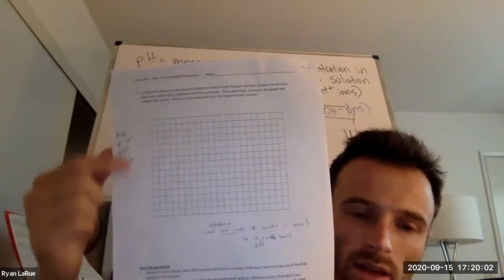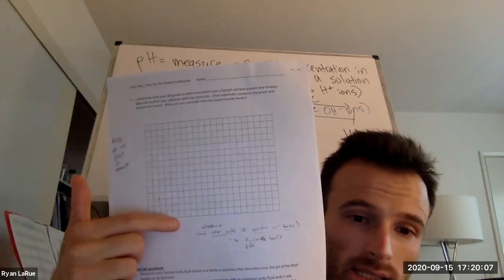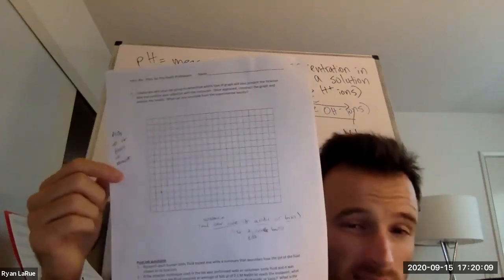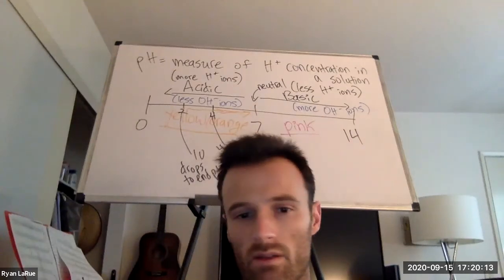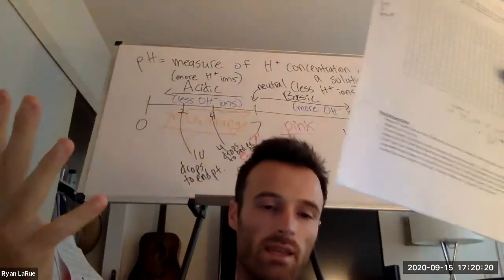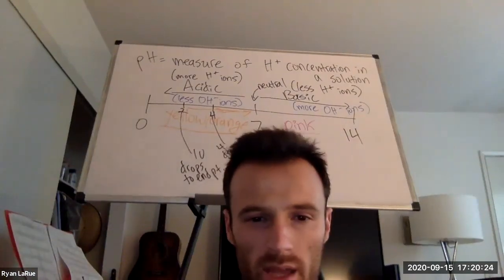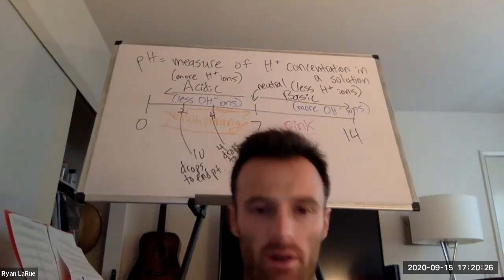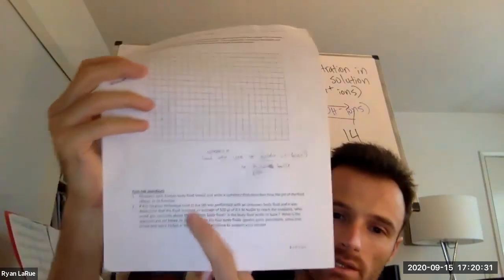And I would color code them too, because you've got acid and base, because the titrant's going to be different, right? It's either going to be the base or the acid. So you could color code the compounds that are acidic, and then you would have average number of drops of titrant, and the titrant would be the base. A bar graph. And you will want to do the post-lab questions this time as well.